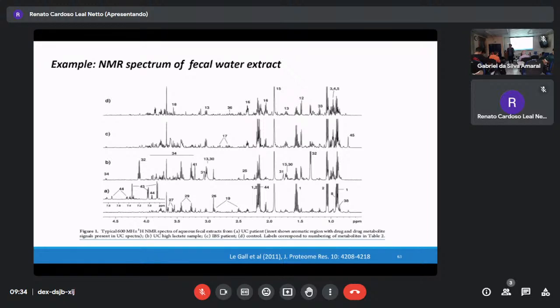Instead, after NMR, I prefer to do GC-MS because the main products from microbes are short chain acids. But in animal cases, I can roughly identify the major short chain compounds. For those, I would like to use just that.